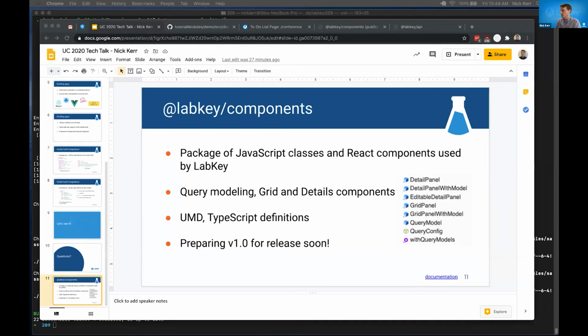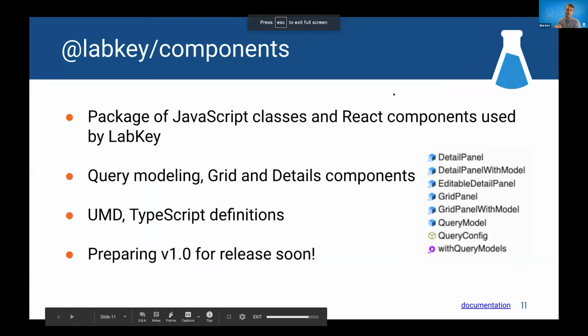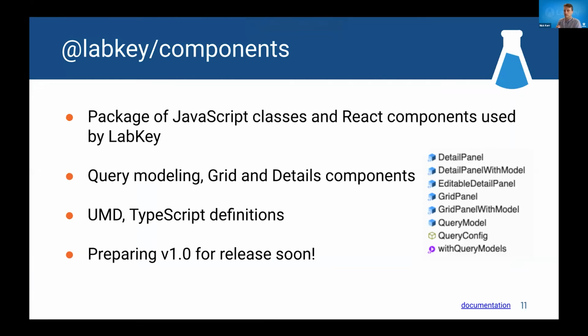There is one other aspect I wanted to talk about. We are going to be releasing soon LabKey components, which is a set of components that we use. This is the stuff we've been developing over the last several years that we've really battle tested. We want to release it so that the community can leverage it against LabKey to display data in a more efficient way, or in a way that looks similar to how we display data in our applications. This is a package of LabKey classes and React components published by us.